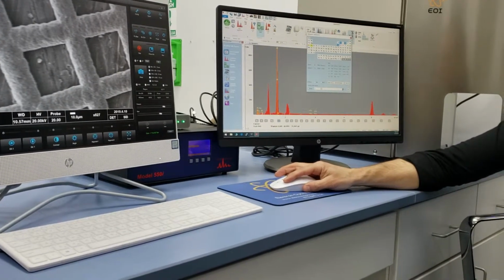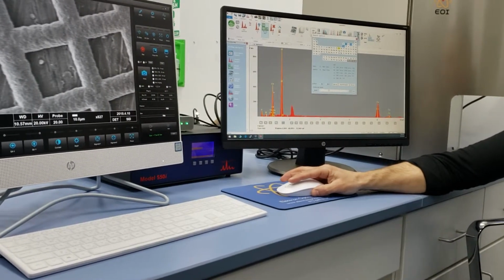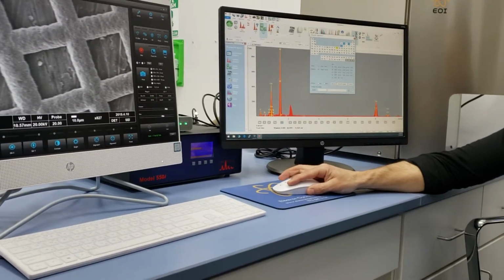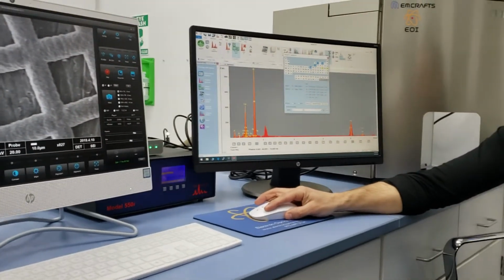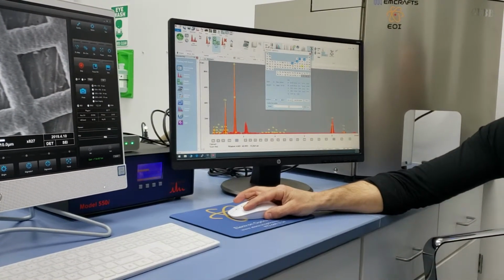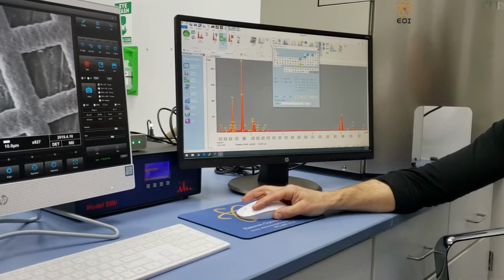Whoop. Back up one. It lined up with that peak and lined up with that peak. That's definitely there. Add. We had that guy too. Keep going. Whoop. Hang on. Back up. Add. Keep going. Still waiting for another peak. Add. There we go.